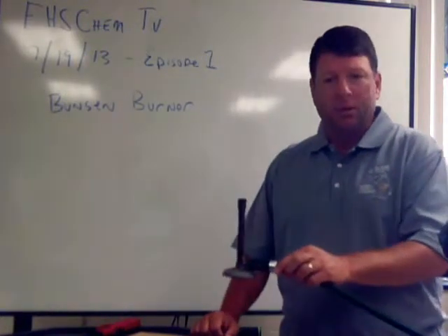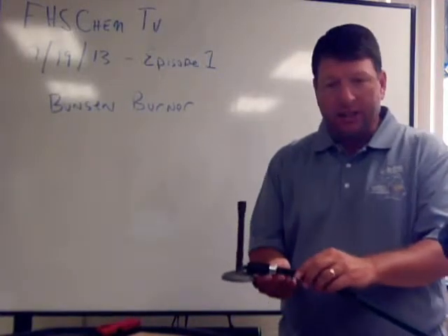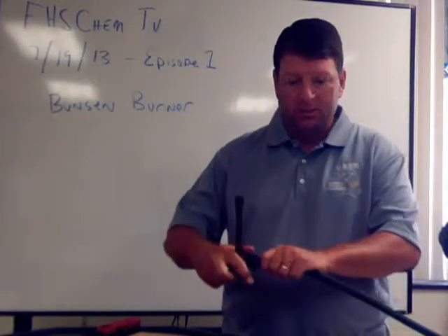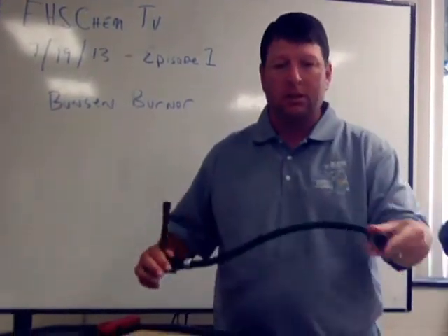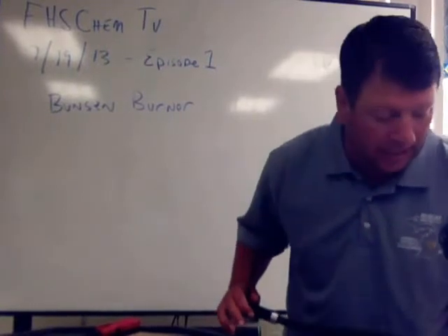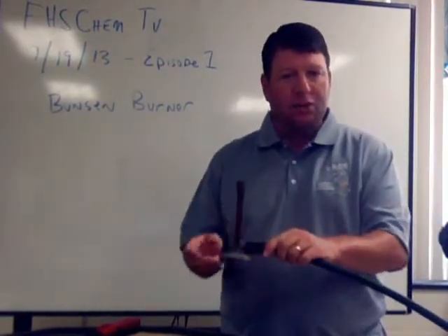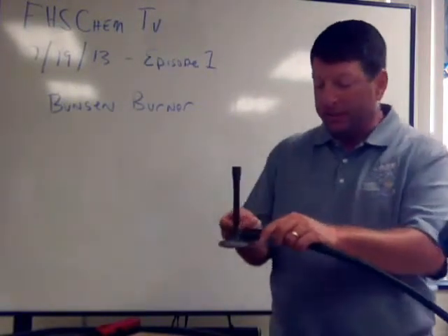First of all, the parts of the Bunsen burner. Here's the Bunsen burner we were using in class. It has four main parts. The first part that I'm holding here is the gas intake tube. This tube will slide onto the hardware for the natural gas that we use in class — you just slide that on, and the Bunsen burner will already be attached to the tube.